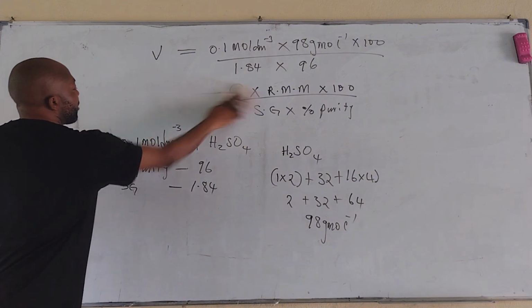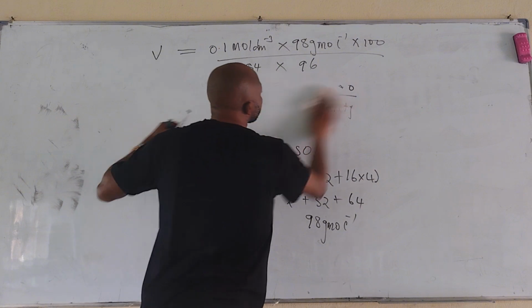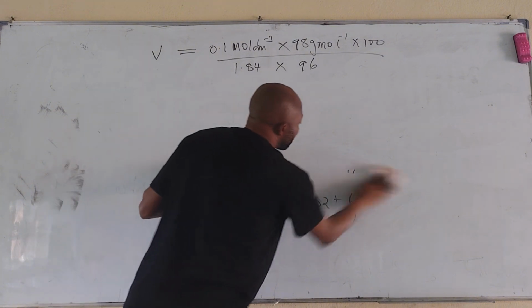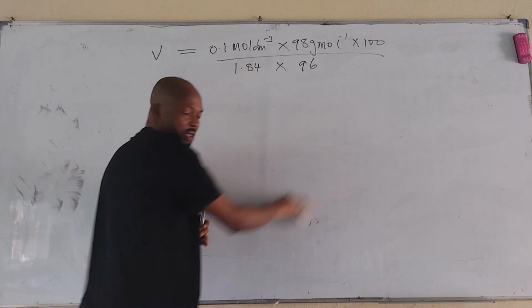So I proceed to multiply out those variables so that I'll know what the volume concentration is.